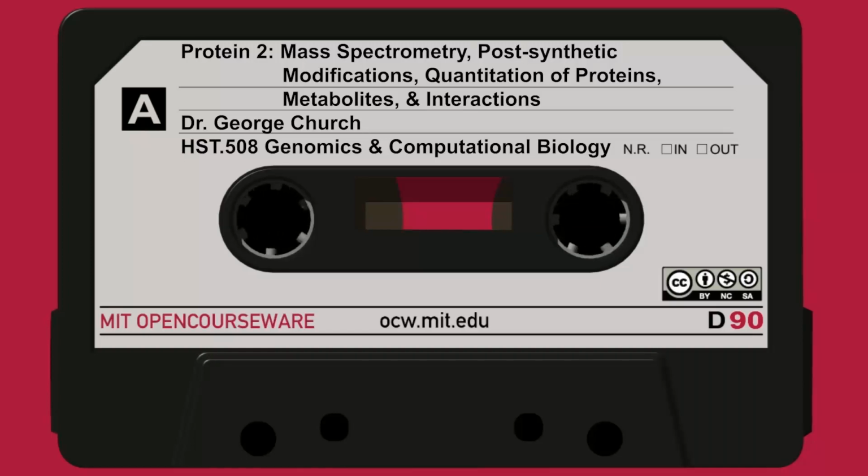These have been synthesized so that they march along the proteins, very analogous to how, in an earlier class, Rosetta made synthetic oligonucleotides marching along the human genome. And this was done in order to calibrate to see how the amino acid composition of a peptide might affect its mobility and allow you to calculate it. And so what you end up with here is a somewhat intuitive way of summing the contributions of each of these amino acids. Now remember, this is done under fairly acidic conditions, so the normally charged acid groups will now be protonated and be neutral.